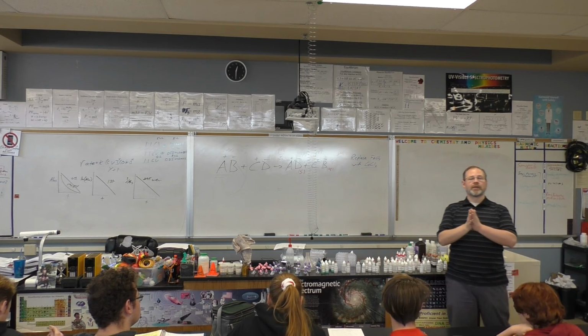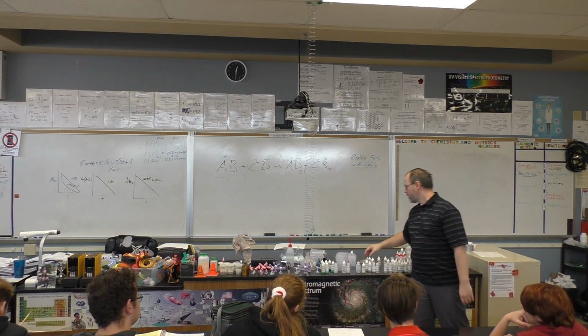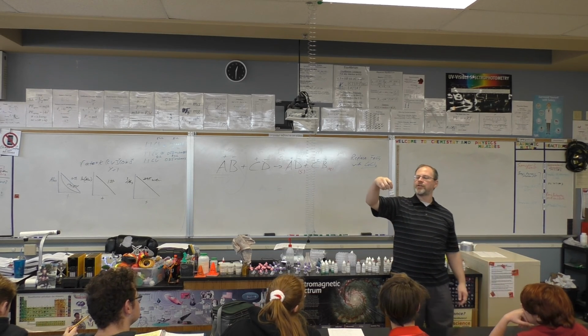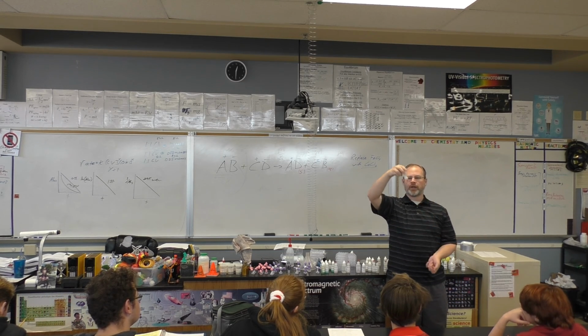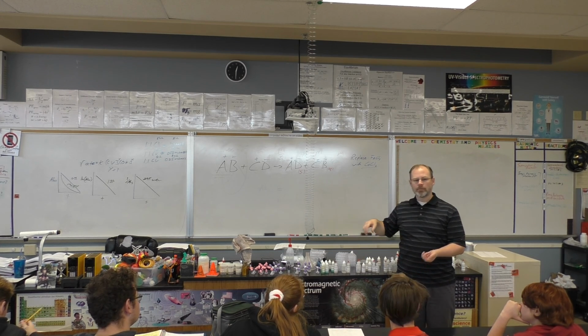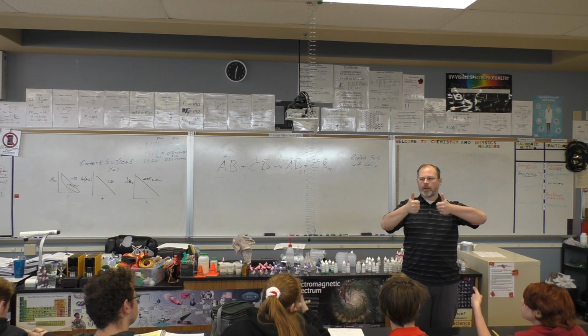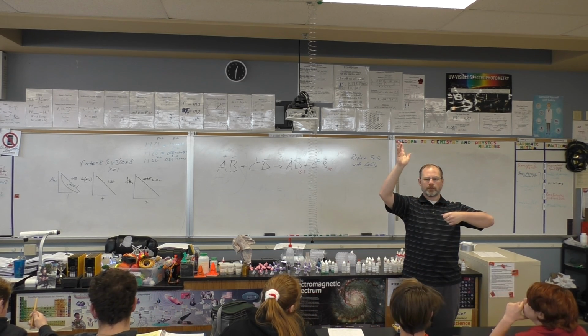Okay, other questions? All right, last thing. I wrote it on the lab, but it is kind of handy. The proper way to use a dropper is vertically. If you don't do it vertically, you can get it on your hands, you can get it all over the place, so vertically, drop, drop, drop, drop. That being said, if you're ready to go, give me some thumbs up. If you have questions, wave your hand around.